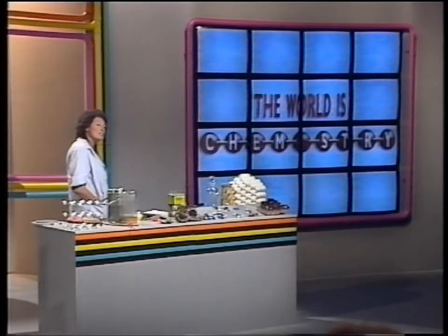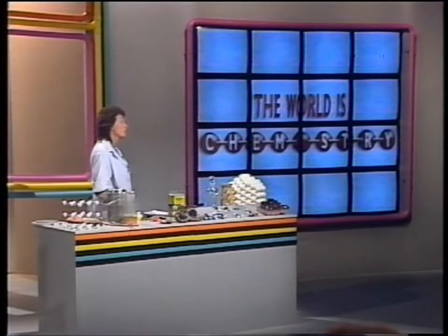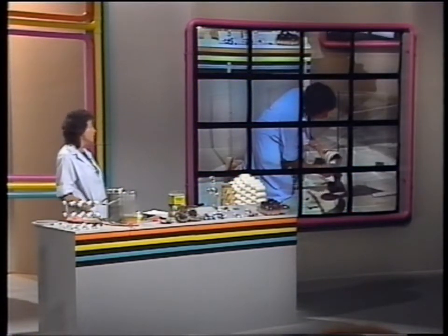Earlier this morning we did a reaction where we took an ore of iron and mixed it with aluminium to get molten iron out of the rock and mineral. And here you can see me putting this mixture into the flower pot.